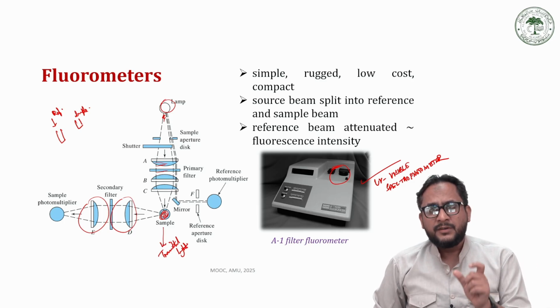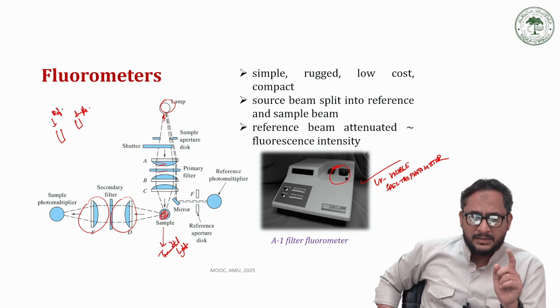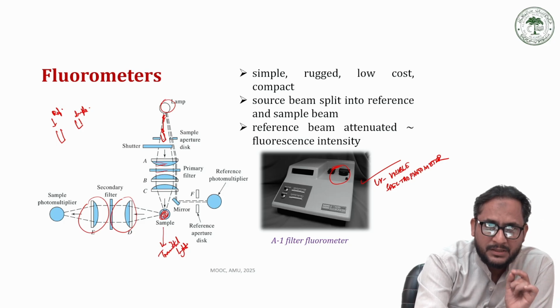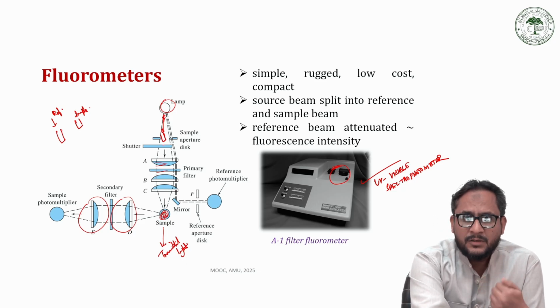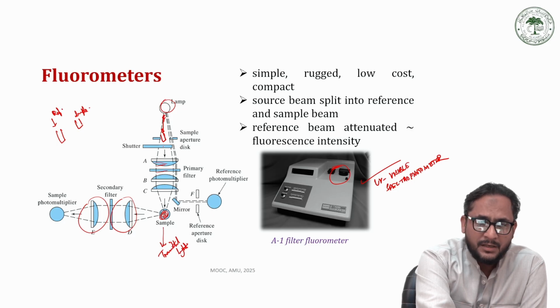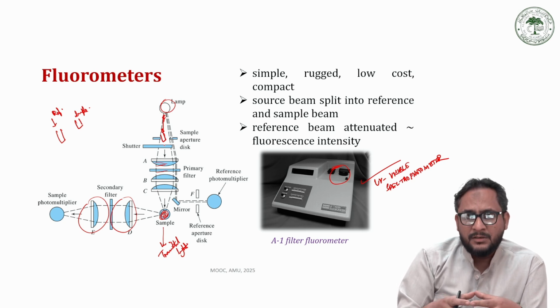So, if we are going for a low cost spectrophotometer, it is a single beam spectrophotometer, which has a single light radiation that passes through one sample tube only. There is a slot for placing one cuvette at a time. First we use the cuvette for analyzing the reference material, then in the second case we remove the cuvette, throw out the reference material, wash the cuvette, put the sample in, and place the cuvette again in its slot. Then we perform the analysis again, and in the second run we capture the sample details, and the two are matched for analysis.